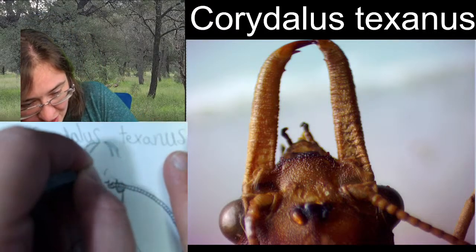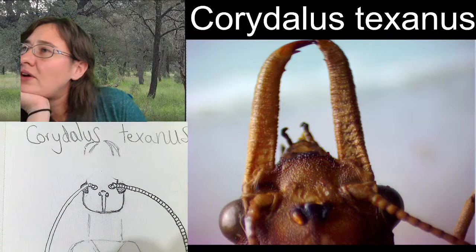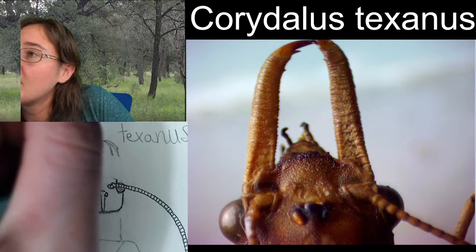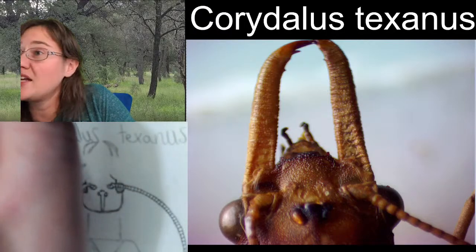Not at that angle. Up. Yeah, I mean, it is kind of that angle.